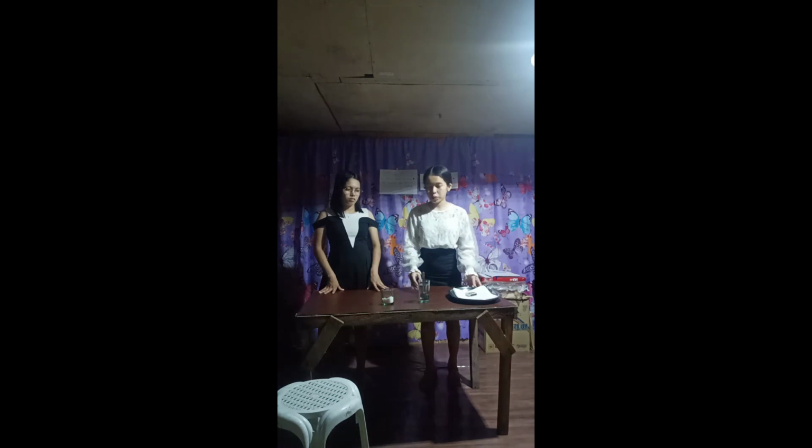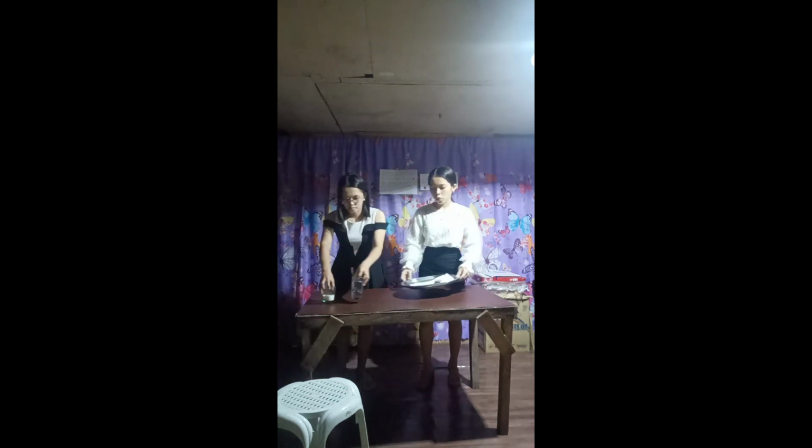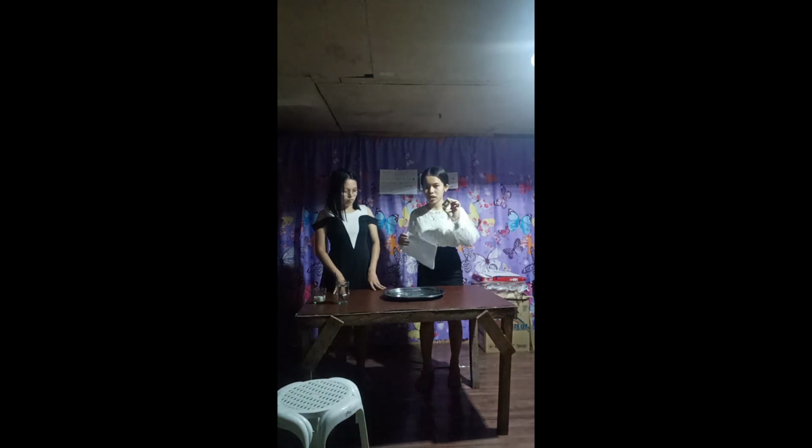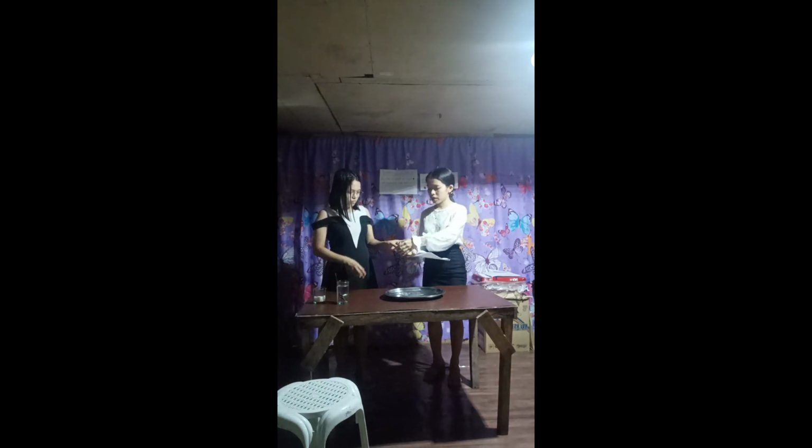So in our second experiment, we will just burn these papers using the matches. So Pearl, can you please burn this paper?